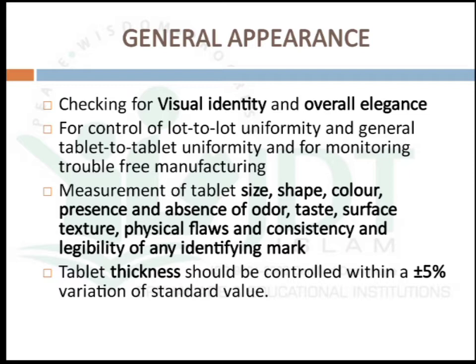These tests are mainly performed for checking the visual identity and overall elegance of the tablets. Also, these are performed for the control of lot to lot uniformity and general tablet to tablet uniformity, and also for monitoring trouble-free manufacturing.